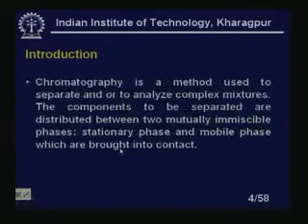Introduction. Chromatography is a method used to separate or to analyze complex mixtures. The components to be separated are distributed between two mutually immiscible phases, the stationary phase and the mobile phase, which are brought into contact. These terms we will refer to very frequently throughout this lesson.